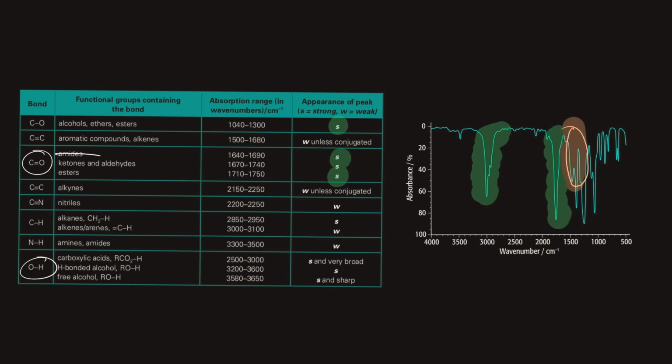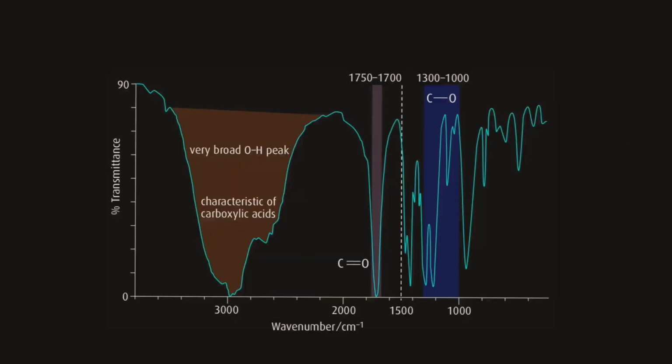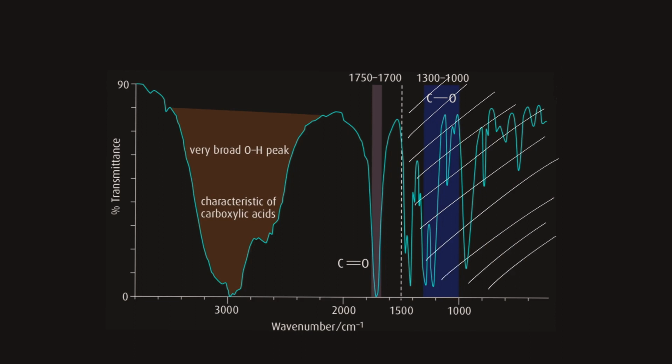This part, that would be a weak peak. Now here, we're taking a closer look at an infrared spectrum of a molecule. One thing to note is that any value lower than 1500 over here is considered the fingerprint region. The fingerprint region is 99% of the time not really our concern. So we'll just remove all of this from what we're trying to analyze.